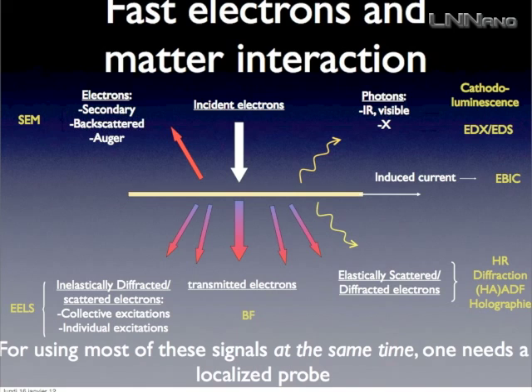So it's also like EELS, more or less. Okay, and there is a last signal, there are many others, which is induced current, but I won't comment on this. Okay, so there is a lot of information that at the end of the day may be used to make images, or maybe used to make a spectroscopy for chemical application, photonics application, or whatever.